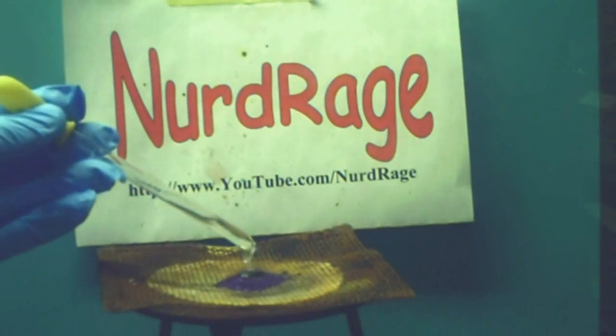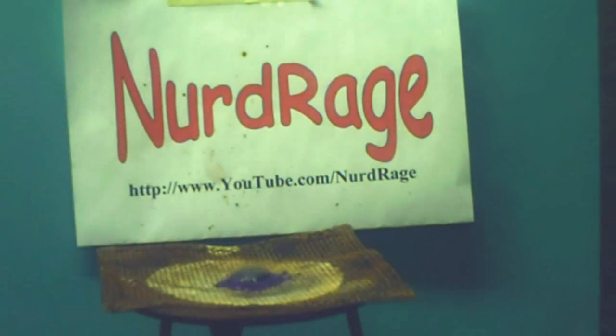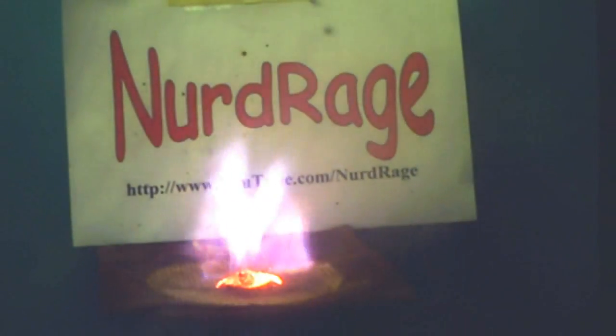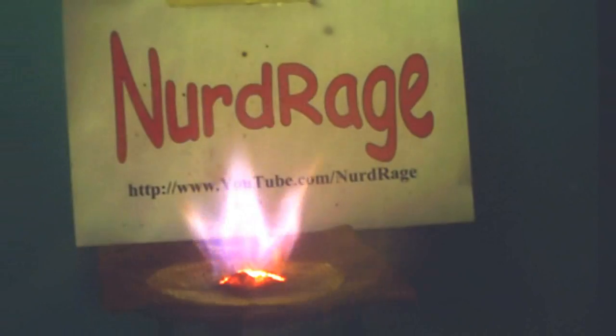First, a small amount of potassium permanganate is mixed with glycerin. The reaction might be too slow to do anything, so we added a few drops of water to get things going. There we go. Fire with potassium permanganate and glycerin.